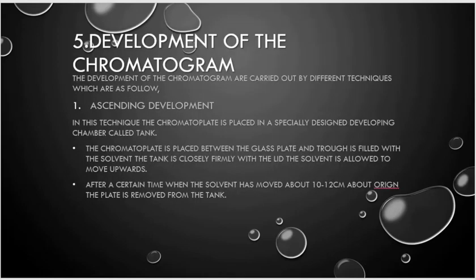Now this is the fifth step, in which the chromatogram is developed. This is the development of a chromatogram. The development of a chromatogram is carried out by different techniques. The first one is the ascending development.